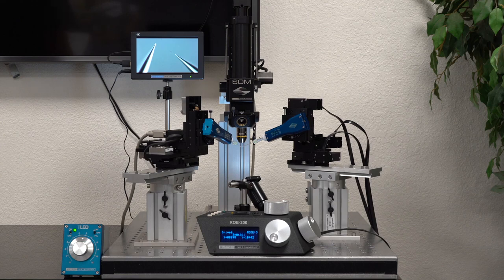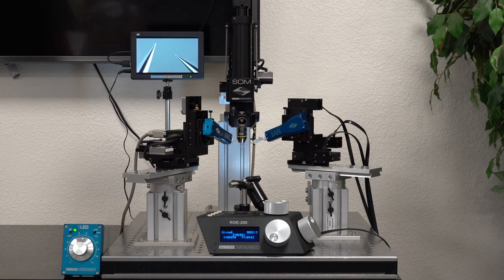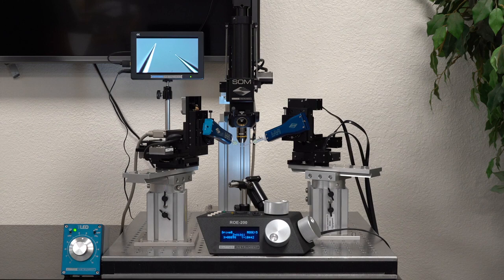This is important for many behavioral as well as sensory stimulation experiments where the behavioral apparatus may be large or a number of computer screens may be used to provide visual input to the specimen.